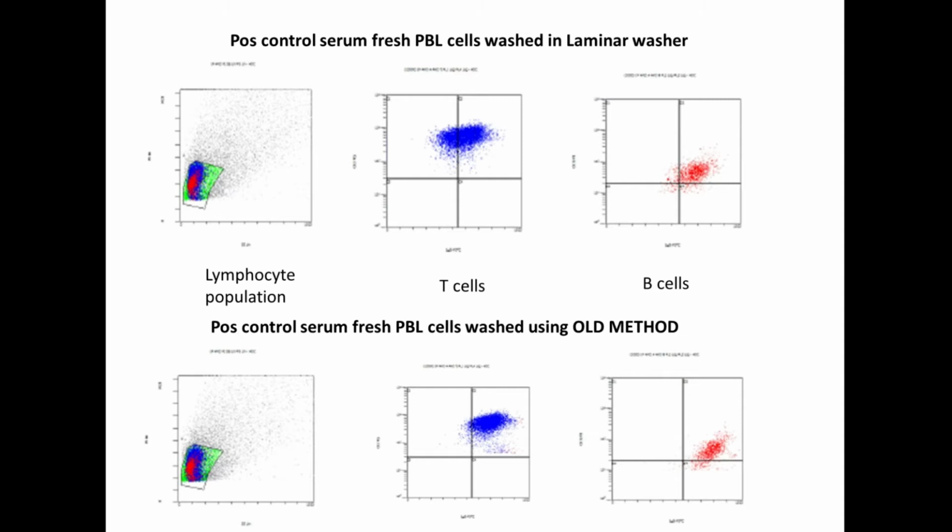The cell surface of lymphocytes need to be intact and stable in order for their Fc cell surface receptors to bind to their respective conjugate markers, such as CD19 for B cells, CD3 for T cells, and FITC for anti-IgG, the most important antibody in the field of HLA and transplant. When bound, these markers emit strong mean fluorescence signals that are measured as MF units in a flow cytometer. The higher the signal of IgG FITC from the cell emitted, the higher the mean channel, or MC, units will be. The greater the difference in MC between your negative control and your patient's serum determines whether your donor cells are compatible with the patient.